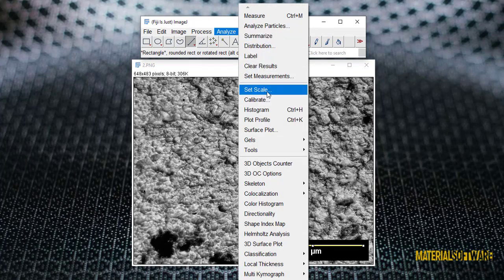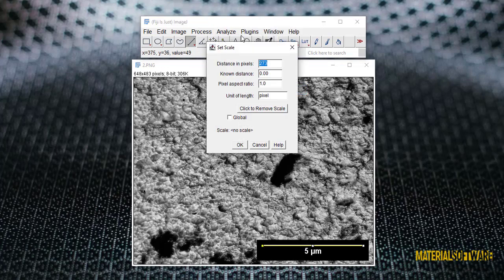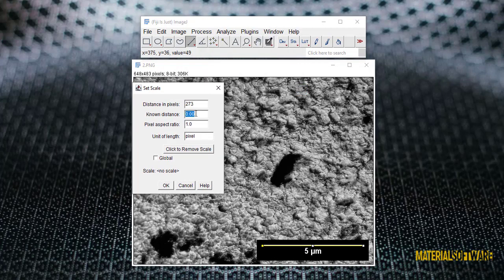Then, from the analysis path, we select the option to adjust the scale and calibrate the image.